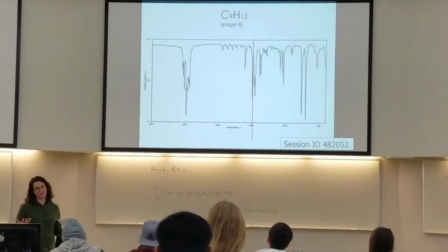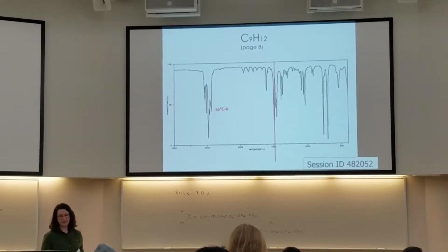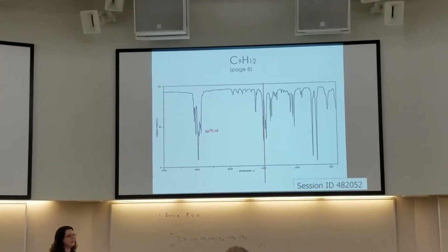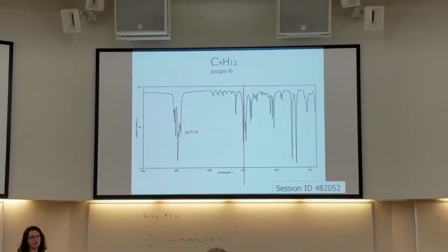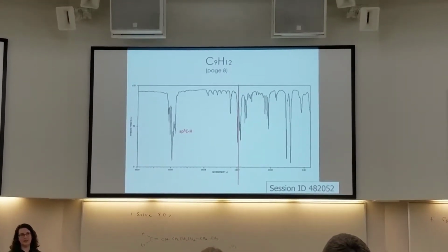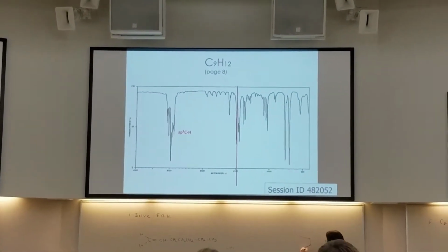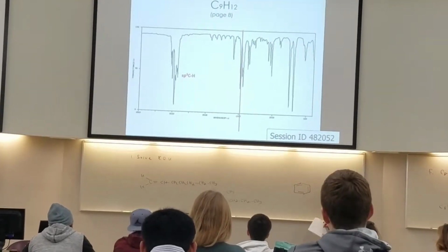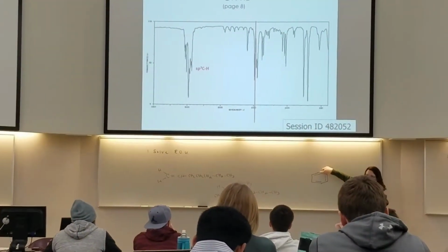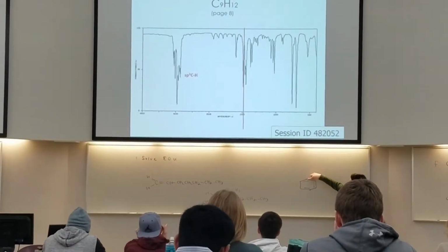So start with the one group of peaks that every spectra has, the carbon-hydrogen stretches, right? So we've got those, 2800 to 3000 wave numbers. And then if this is benzene, what part of benzene is visible on the IR? Maybe a better way to draw it, start by drawing it, right? Okay, so there's components that make up benzene, right? So single bonds would be in the fingerprint region. We're not going to see that. We're not going to at least look for that in our IR spectra.